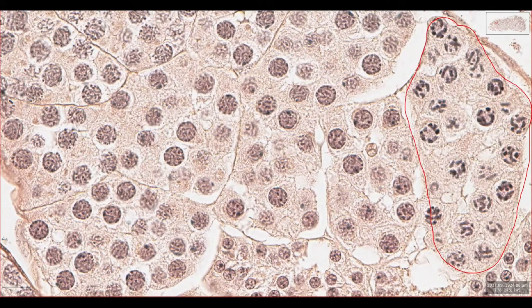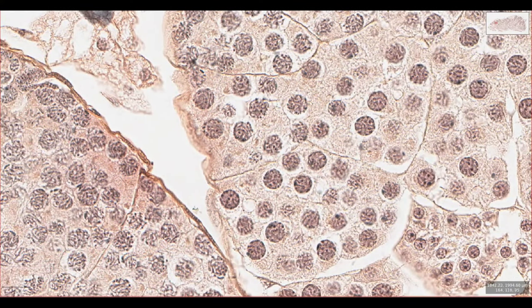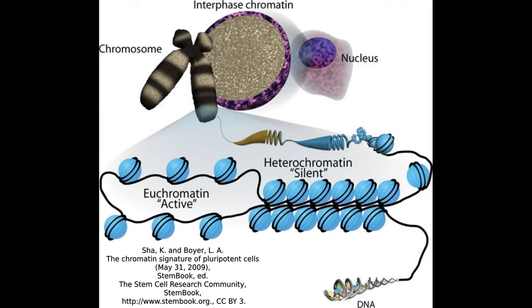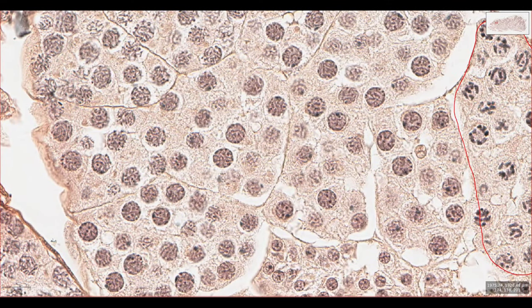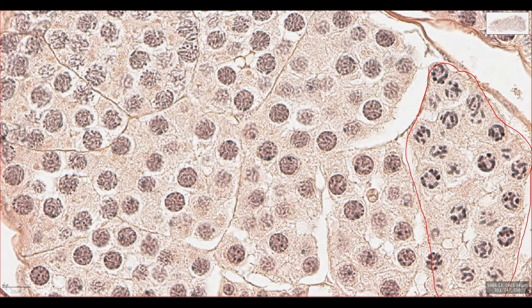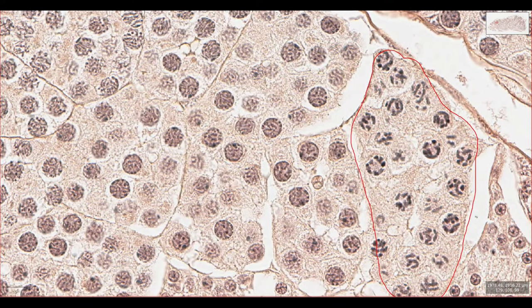The spermatogonia begin to divide in their cysts and eventually increase in size. This area here is called the zone of growth. You'll see that this area is full of large cells with huge nuclei displaying open chromatin. Compare them to the nuclei of nearby cells lining each testis follicle and you'll see what I mean by open chromatin. Usually DNA is wrapped up tightly around proteins within the nucleus, which helps with storage space but also is a means of gene regulation, since tightly bunched up DNA won't be transcribed to make RNA and subsequently proteins.